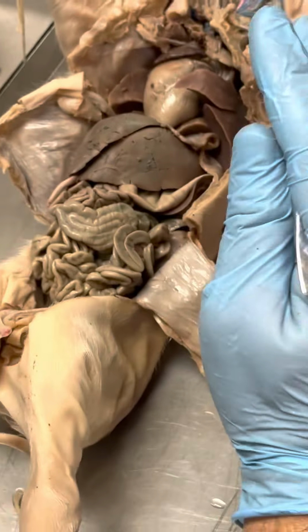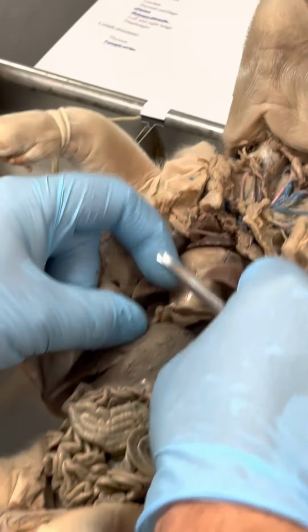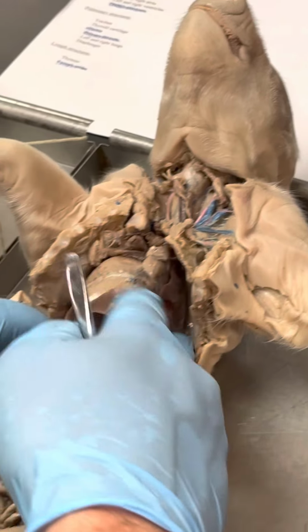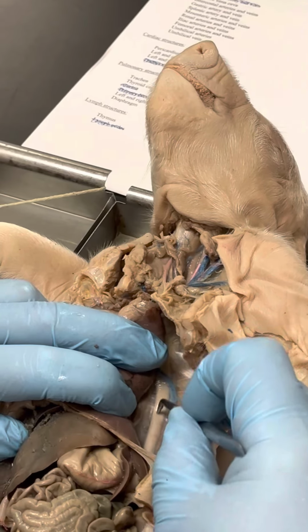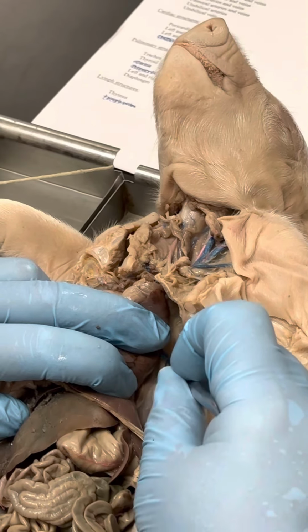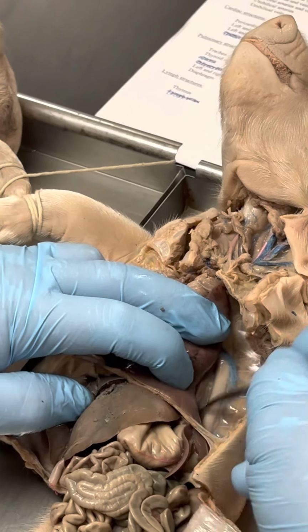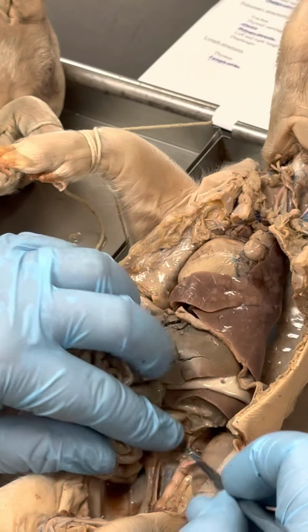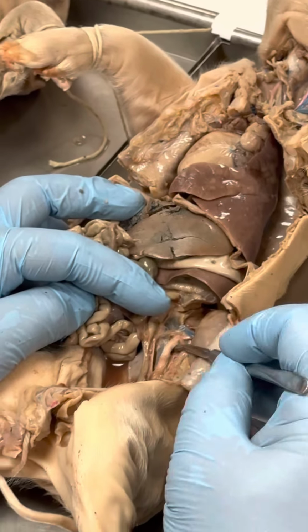Next, let's go thoracic aorta. So here's your diaphragm. That's your diaphragm muscle. Everything, this cavity above it, that's your thoracic cavity. So if you move this to the side, see that white thing? That is your thoracic aorta. Now, once it pokes through that diaphragm, it becomes your abdominal aorta. So I'm just going to show it to you way down here. This is all your abdominal aorta.